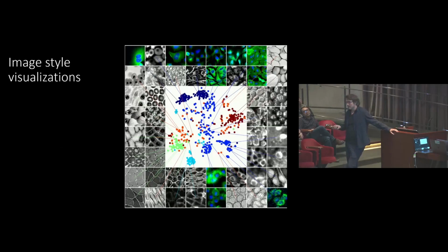The data set that we put together here, about 620 images or so, they are visualized here to give you a sense. These are all little snippets from some subset of cells. They're arranged using a t-SNE plot in the middle here. The different colors are what we labeled, we thought were different kinds of image modalities. You can see they cluster to some extent according to that.